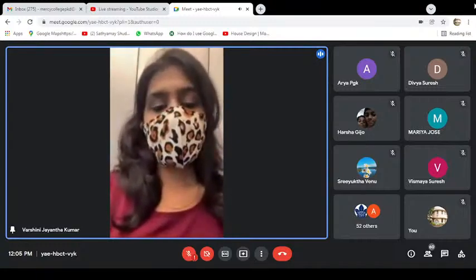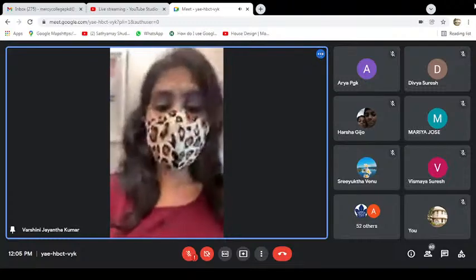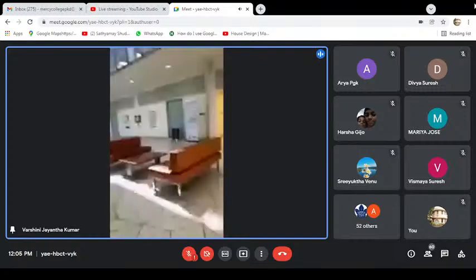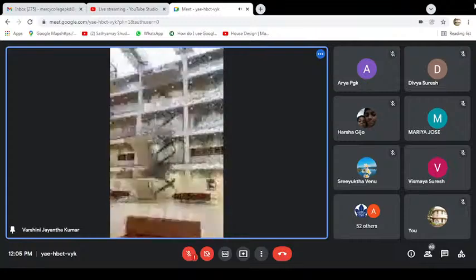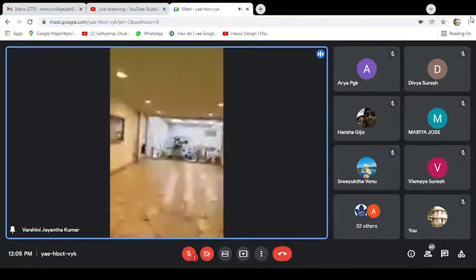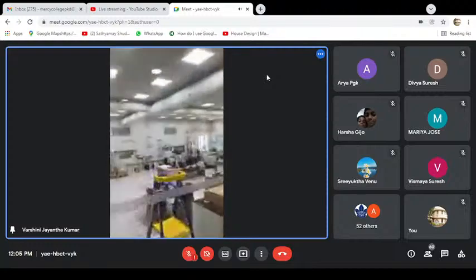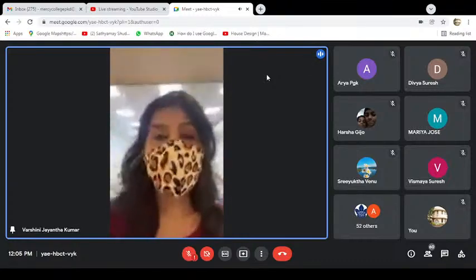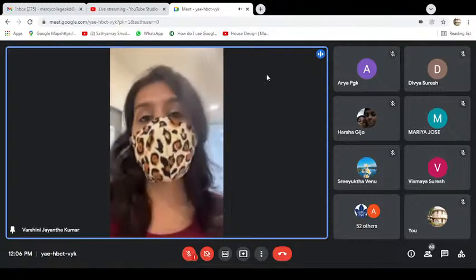So we'll go to the NMR Spectroscopy Room to see the NMR machines, and that's where we do most of our NMR spectroscopy characterizations. It's currently on the ground floor. So this is how the School of Molecular Sciences looks. And that's our NMR room. This NMR room consists of 4 NMR spectrometers, each of which would cost at least 20 crore. It's a really expensive instrument, but it's really helpful for our characterizations.